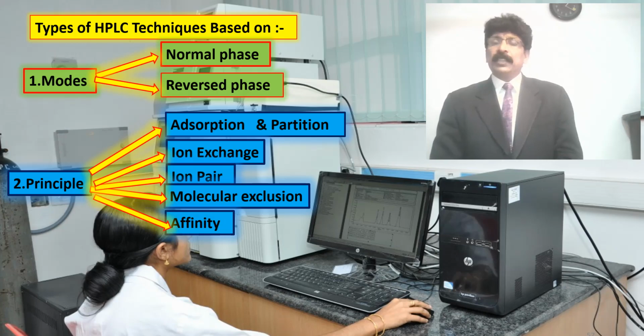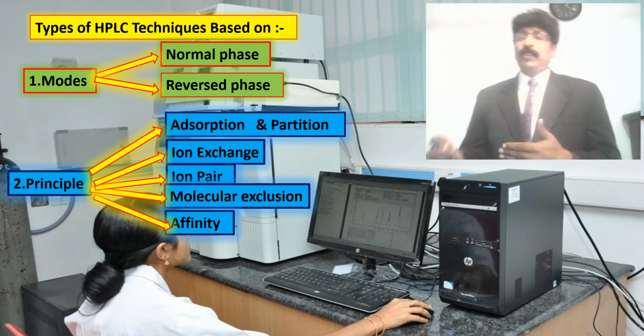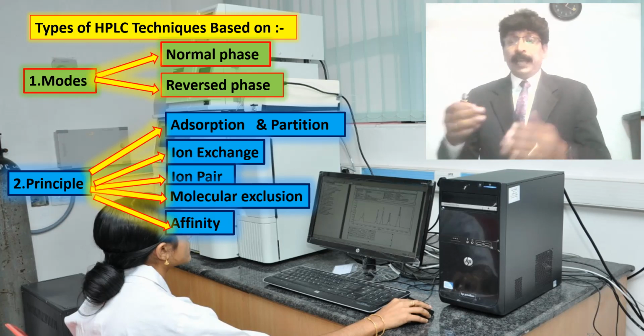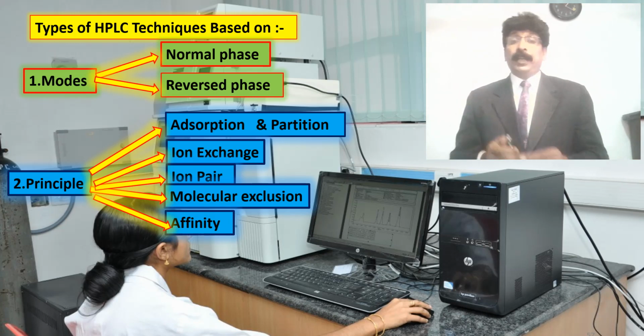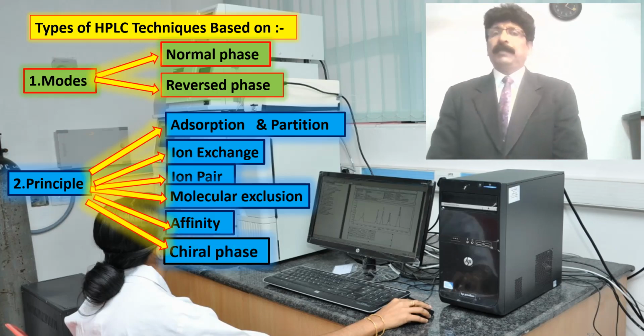Affinity chromatography is specific affinity, used in microbiology, biotechnology, tissue culture and various technologies nowadays. If they want to separate a specific component, affinity chromatography can also be prepared as a column, and that is useful.